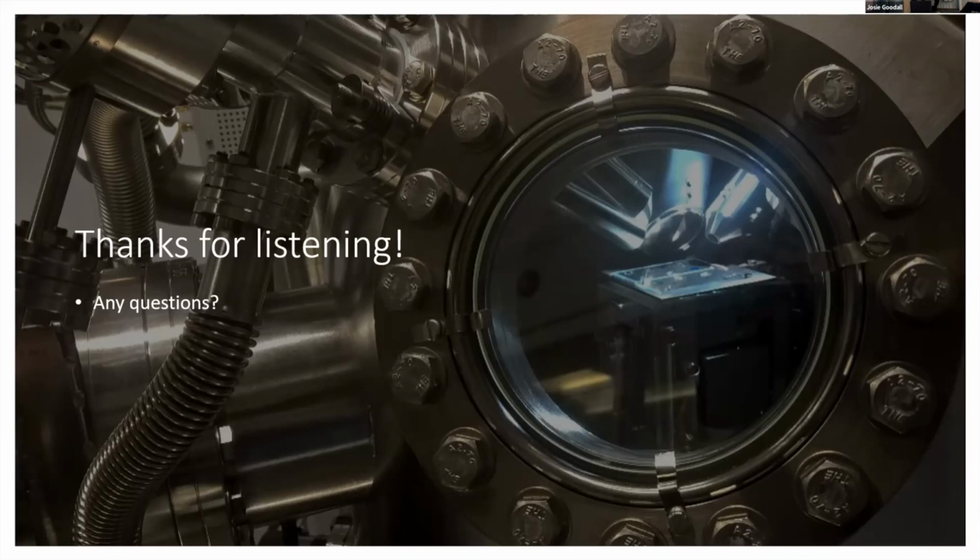Thanks, Mark. I see that you could distinguish between methanol carbon and methoxy carbon. What is the stability of methoxy species under X-rays?